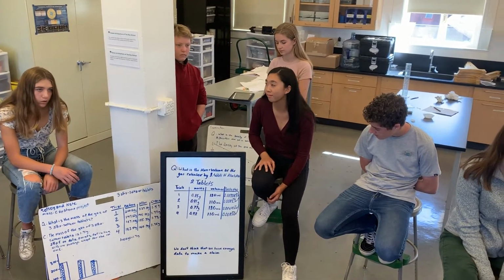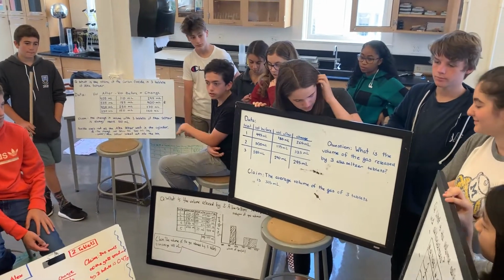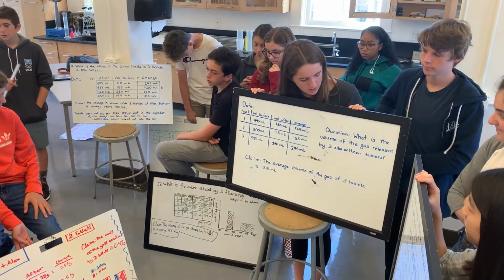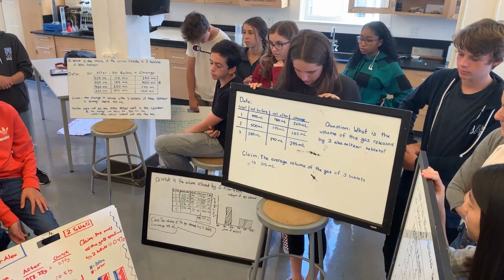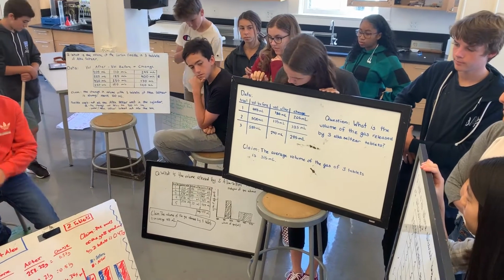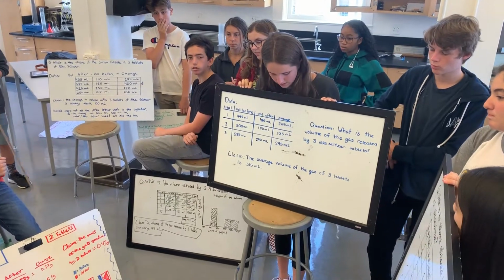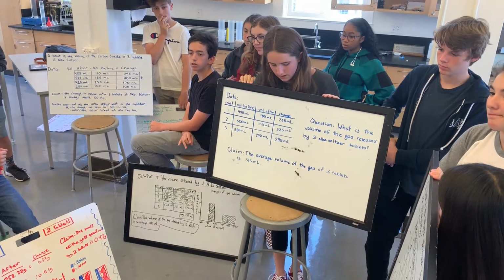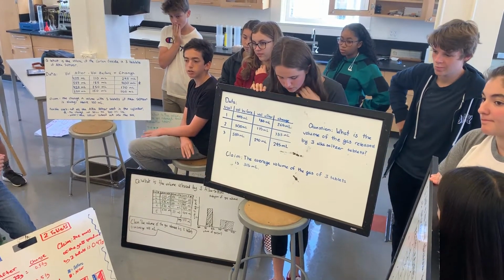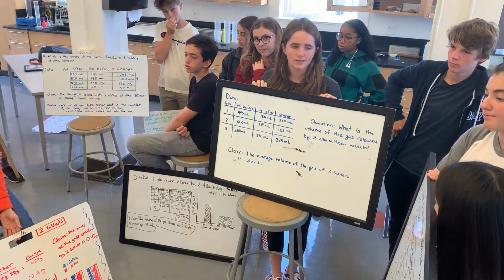Okay. Who's got 3? So our question was, what is the volume of the gas released by 3 Alka-Seltzer tablets? Our change for the first trial was 265 milliliters. The second was 385 milliliters, and the third one was 295 milliliters. And we said that the average volume of the gas was about 315 milliliters.